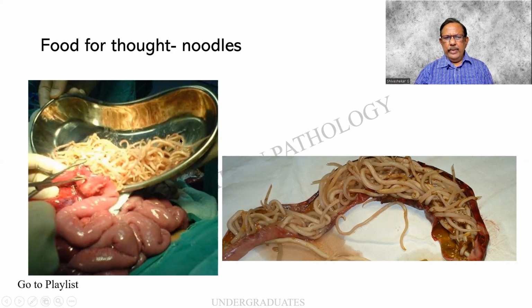And when the surgeon opens it out, he finds that there is a coiled mass of the parasite. A coiled mass, entangled, so you cannot separate them that easily. And obviously, this is leading to an obstruction. This also can lead to an intussusception or a total obstruction. An abdominal emergency. See, it is opened up and I'm finding, can you count the number of parasites?